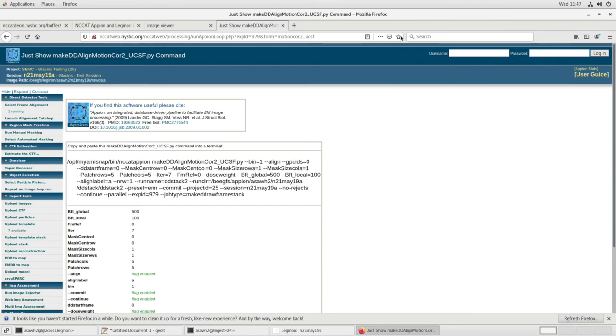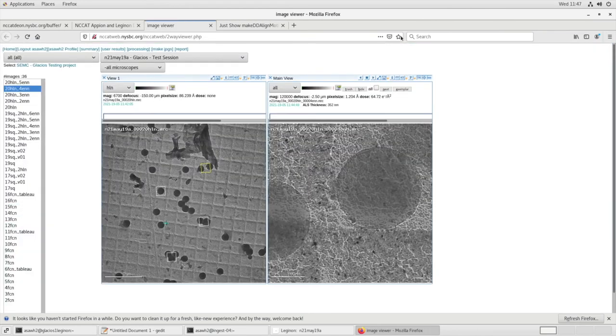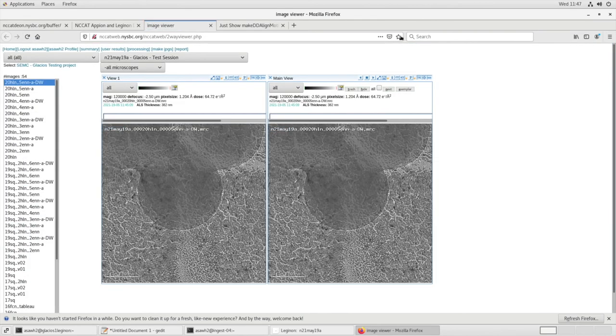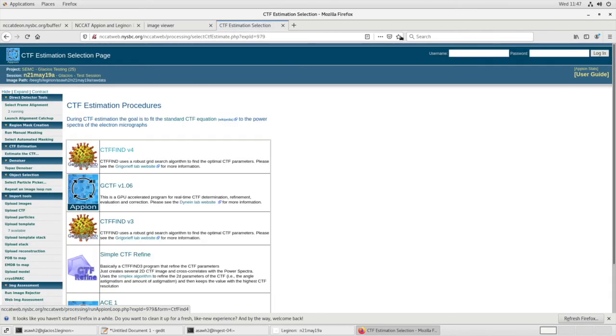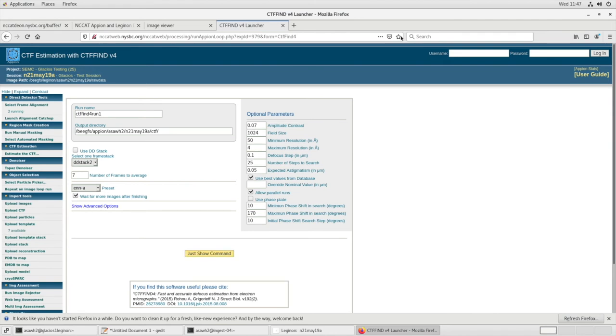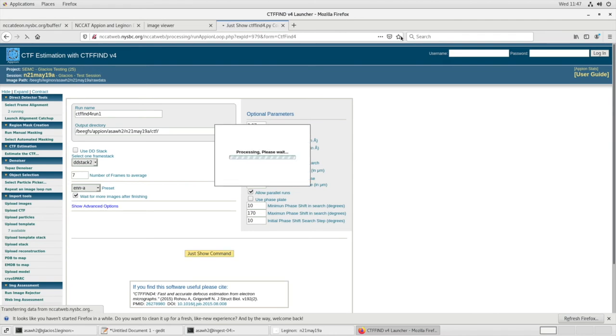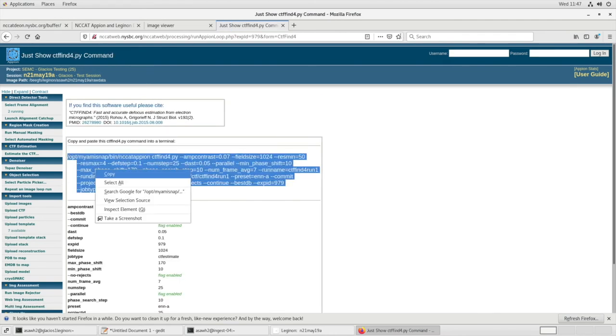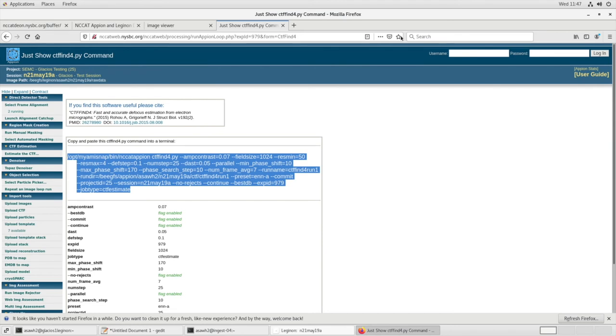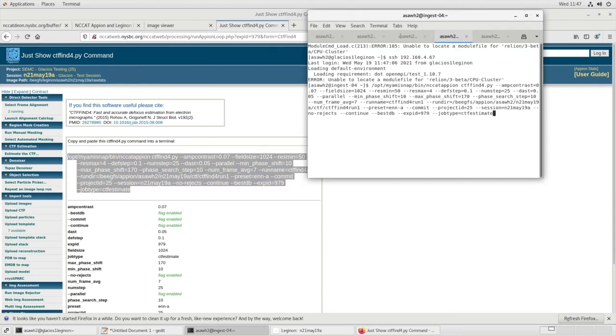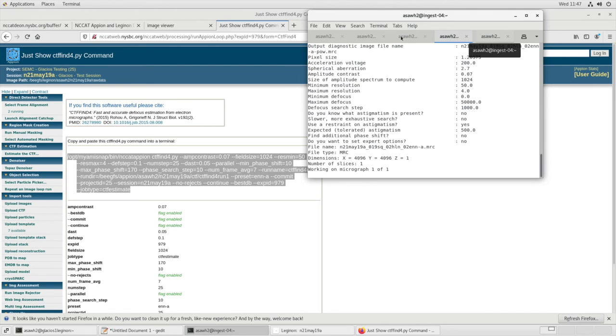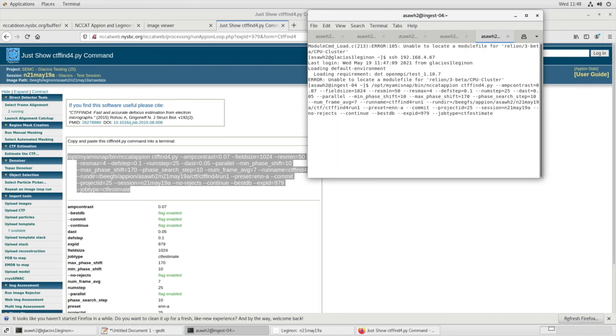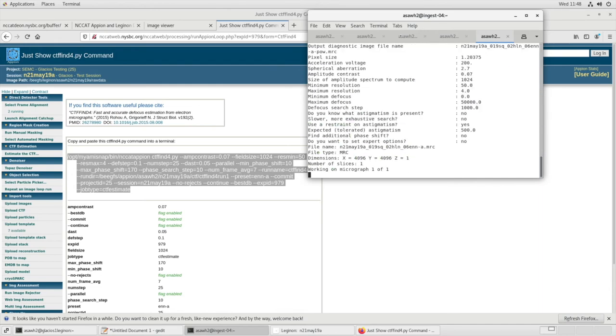Now let's go back to our image viewer. Let's refresh and make sure that we see ENN-A and dose-weighted images. Go to Processing, estimate the CTF, CTF find 4, our ENN-A is preset, and just Show Command. Let's copy this command. Open Terminal, paste your command. Add space, dash dash, and PROC equals 5. Go into the other tab and paste, and repeat. And now CTFs will be generated for each ENN-aligned image.